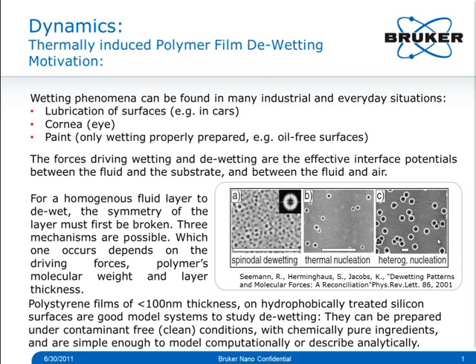The possibilities are spinodal de-wetting, thermal nucleation, and heterogeneous nucleation, as you can see in the pictures taken from a publication by Ralf Seemann et al. And this is actually the collaborating group that we have worked with to create this data.